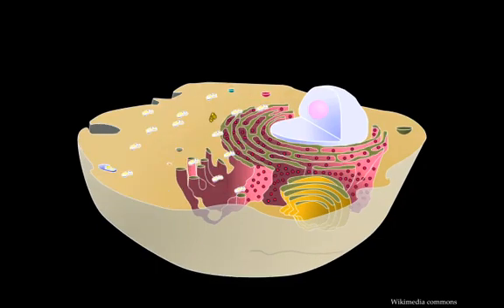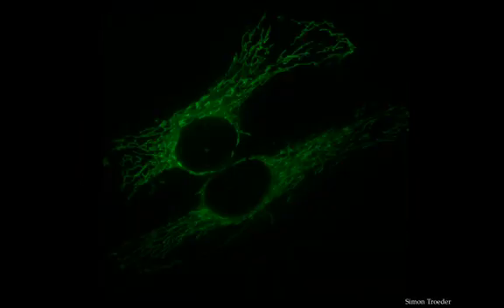Biological structure often exists across several spatial scales, and in this case, if we wanted to study the mitochondrial associations with microtubules to form the mitochondrial networks, we would be unable to with light microscopy. This requires both a broad field of view to image the larger cellular architecture of the microtubules, but also very fine resolution to see subtle contacts between them. In this image, we can see the mitochondria with GFP, and there's some suggestion of a complex organization, but we can't really see the fine details.